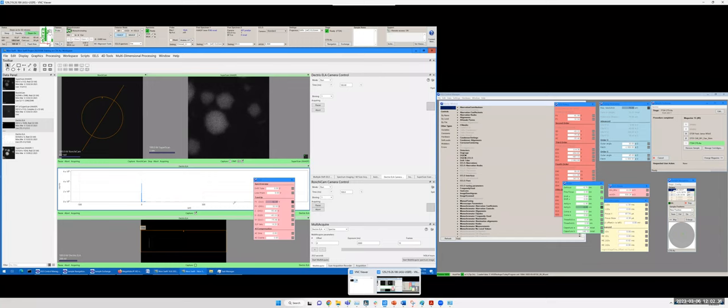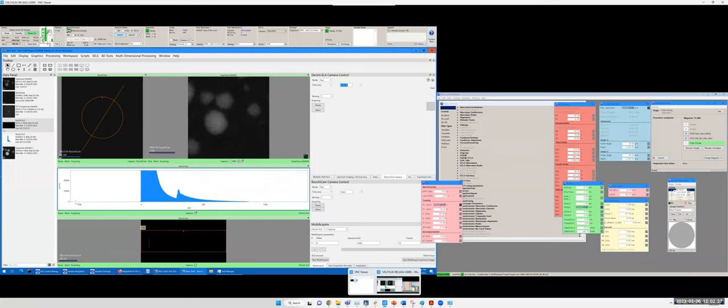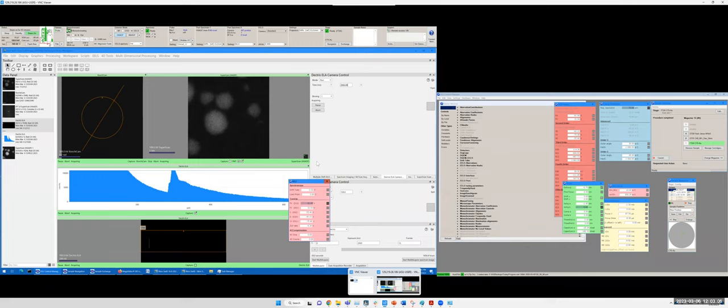Now I want to see the carbon. Probably we already see the carbon, so I just need to type in a longer acquisition time. Let's see, 2 seconds, and see how it looks. Okay, carbon, right? This is the carbon K edge. Now, since we're looking at gold, I want to show you something like gold. Let's say I go to 2000 eV.